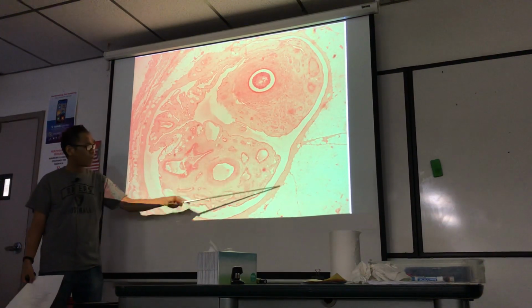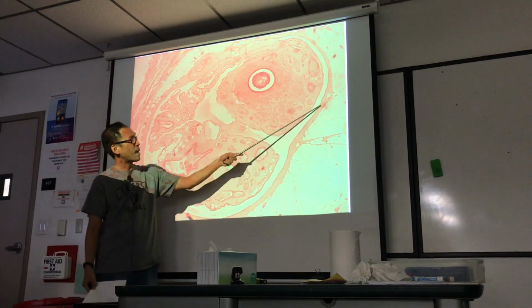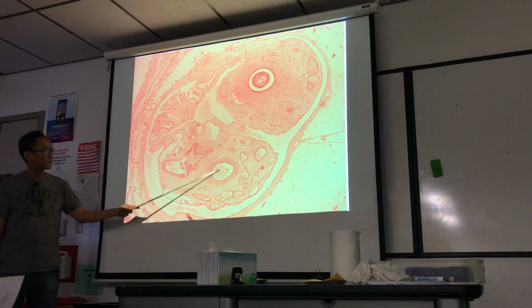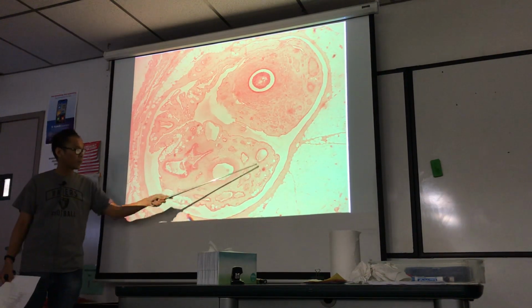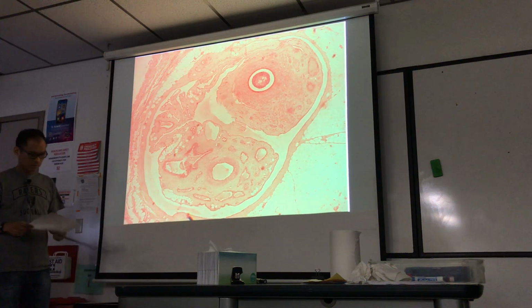That's smooth muscle of the vas deferens. This border all around here is the internal spermatic fascia, all the way there. The blood supply: this blood vessel is the testicular artery. All the other ones are the pampiniform plexus, or just call them testicular veins.